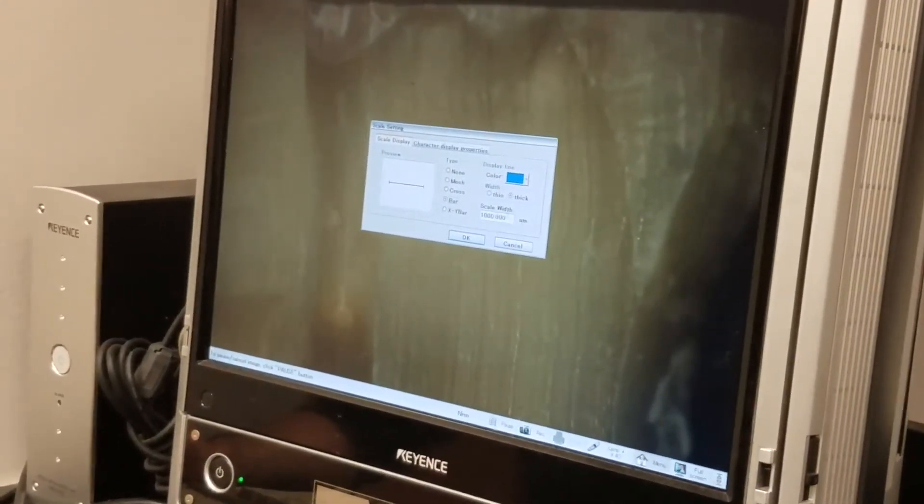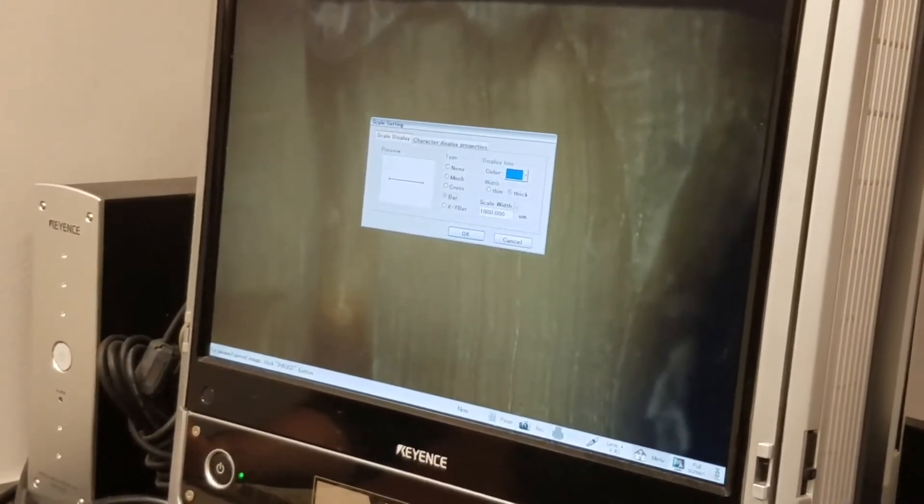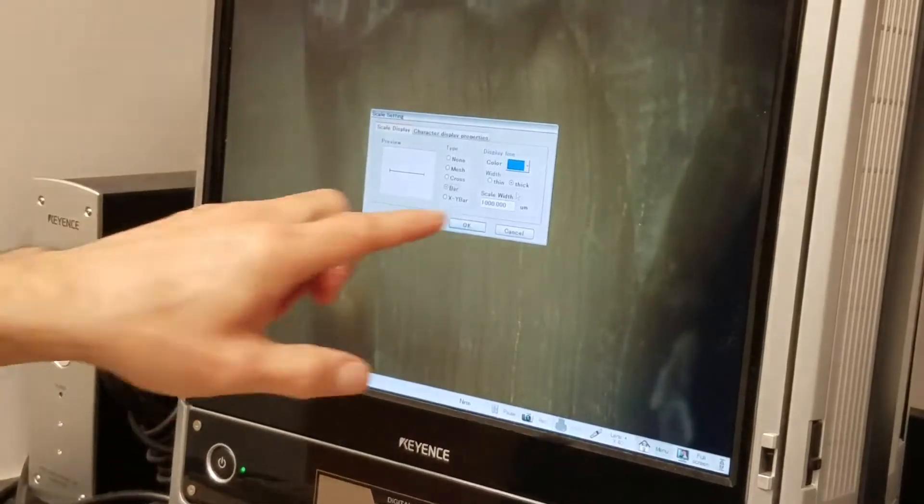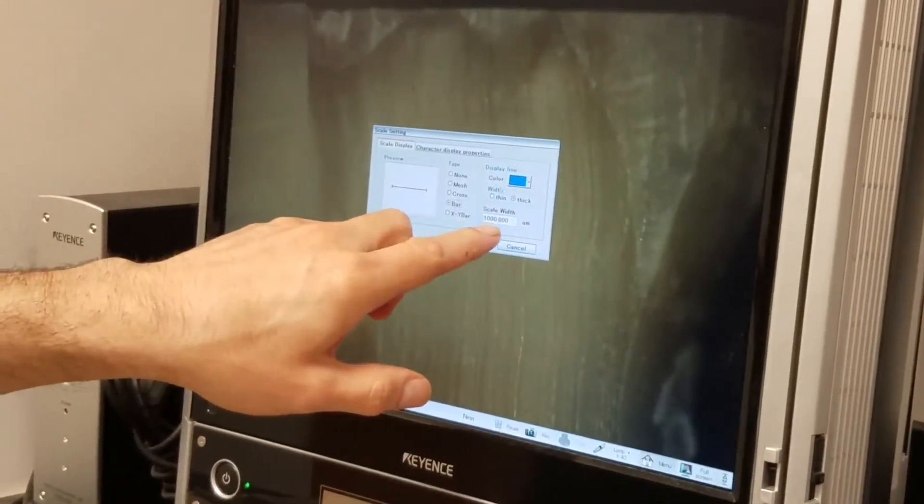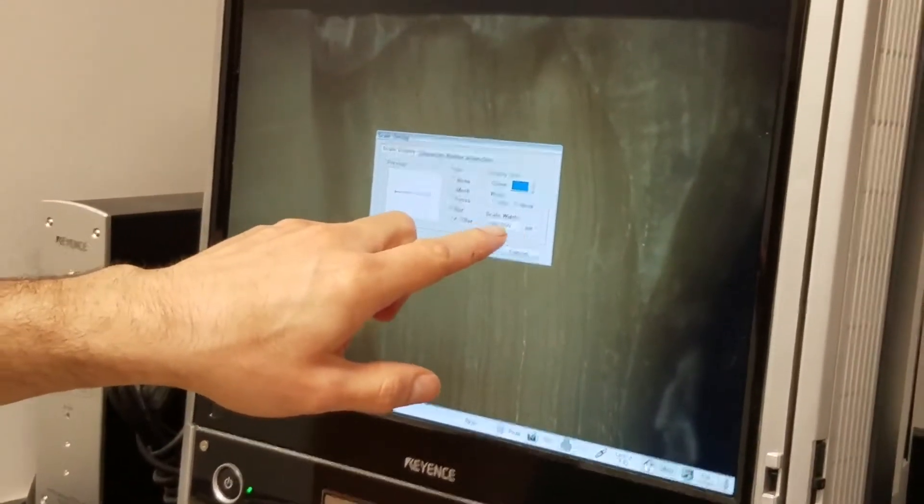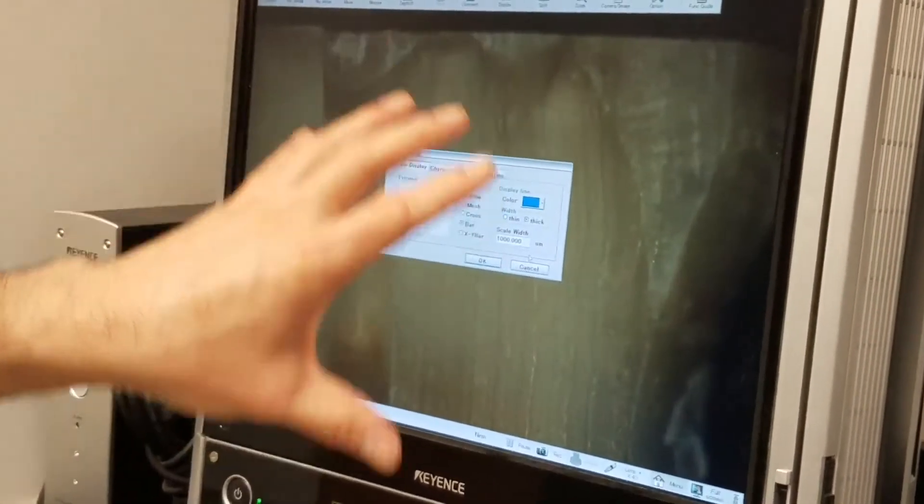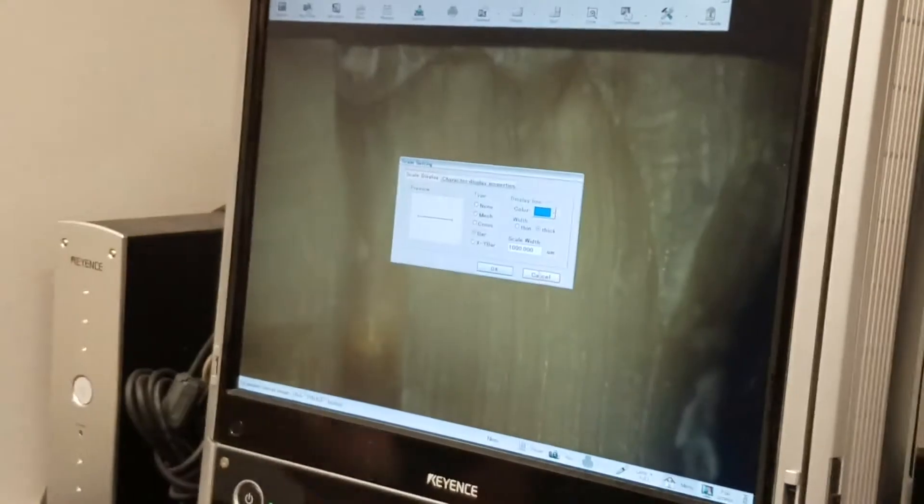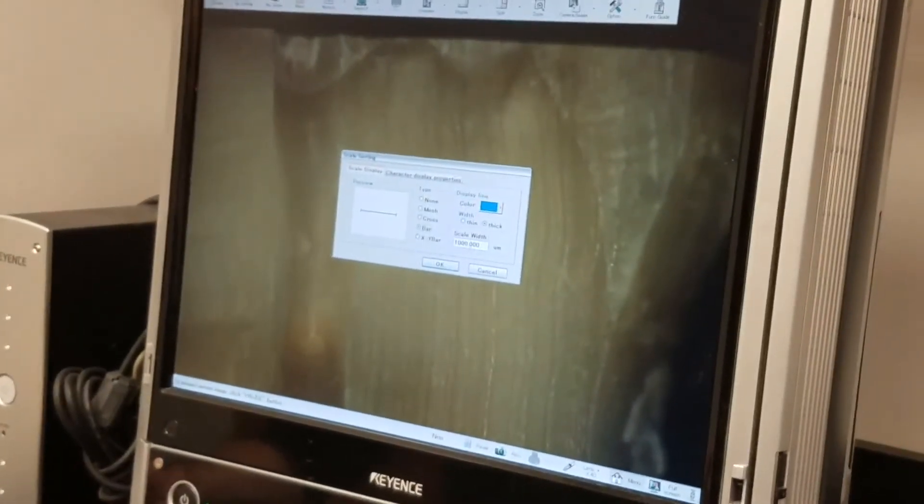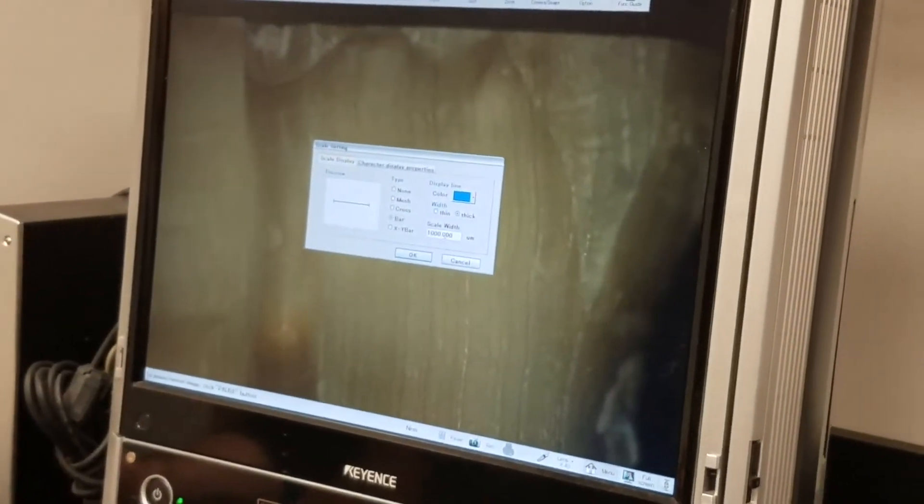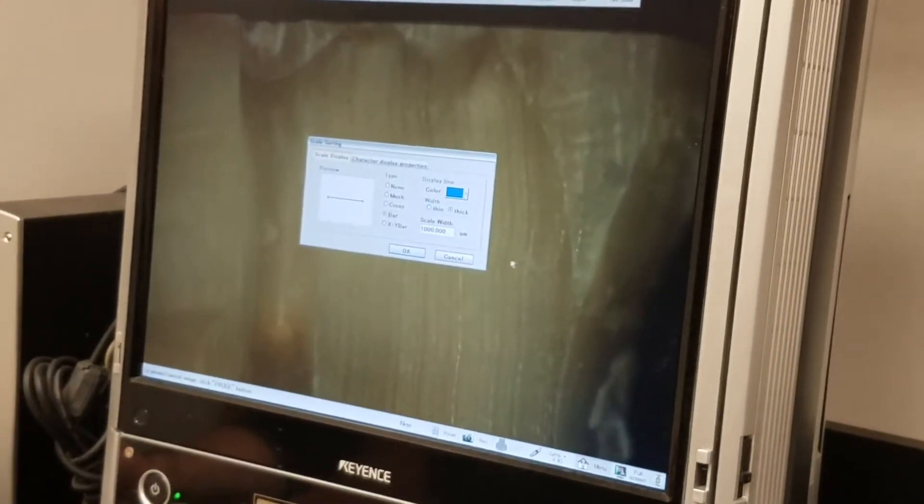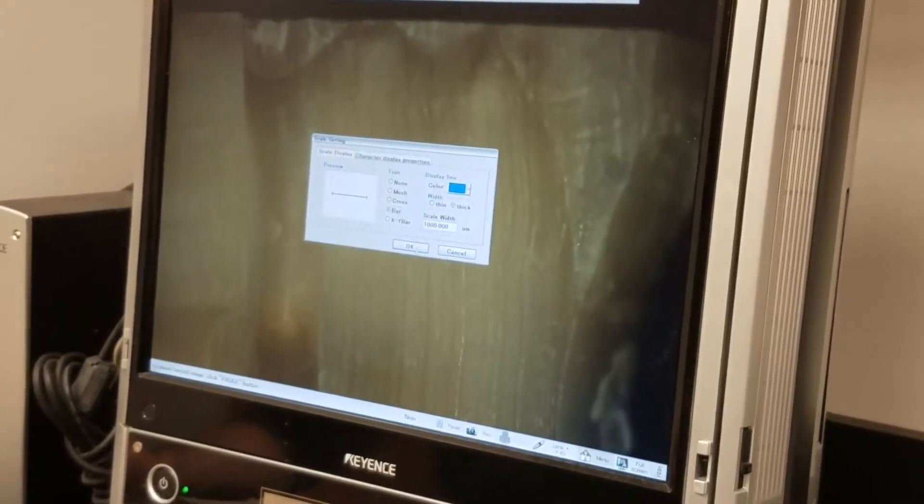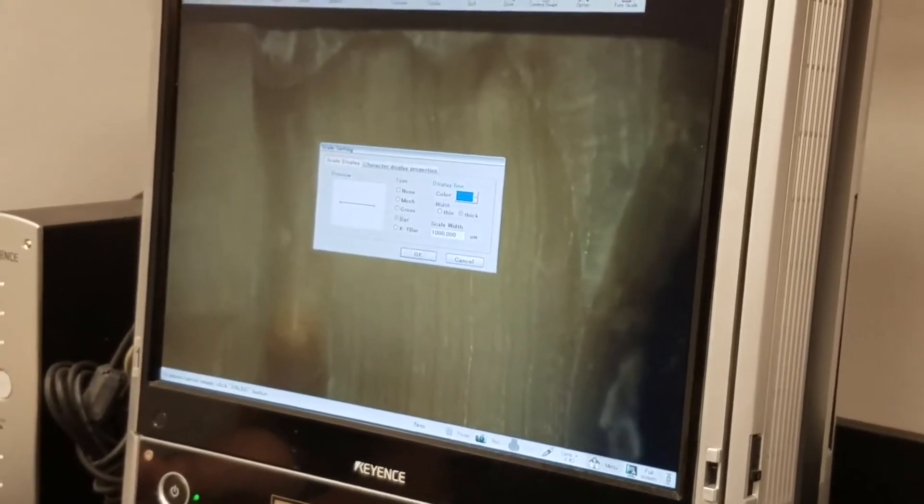And you've got to figure out how big the scale is. So if you're super zoomed in, you can't have a scale that's a thousand microns. But since I'm not too zoomed in, a thousand microns is a millimeter, and I can use that as my scale setting. So I press OK. And so now I've got a scale on here that's a thousand microns or a millimeter.